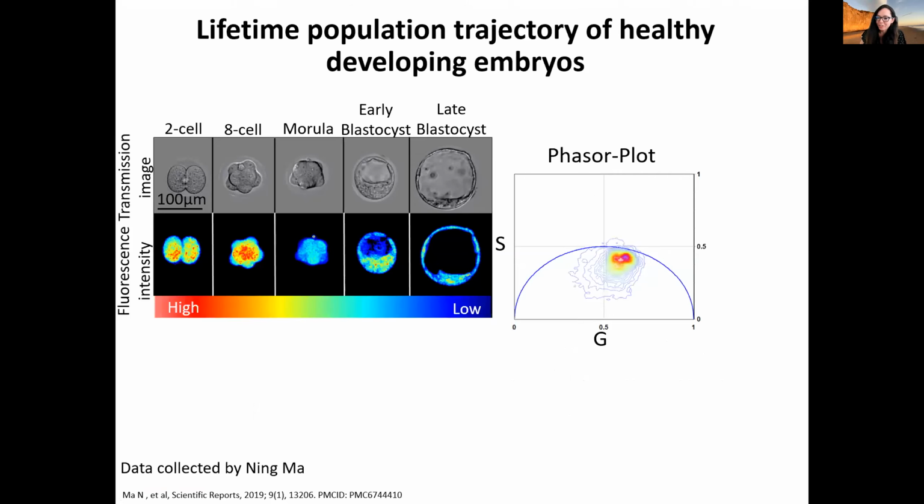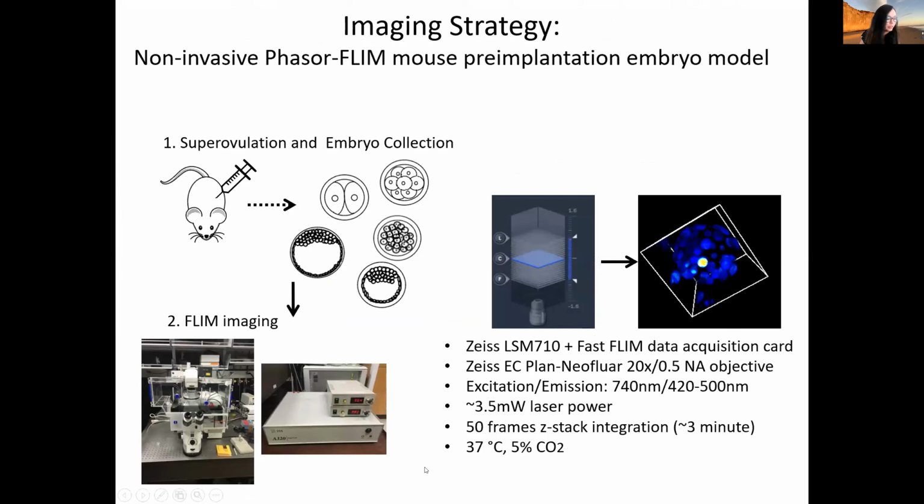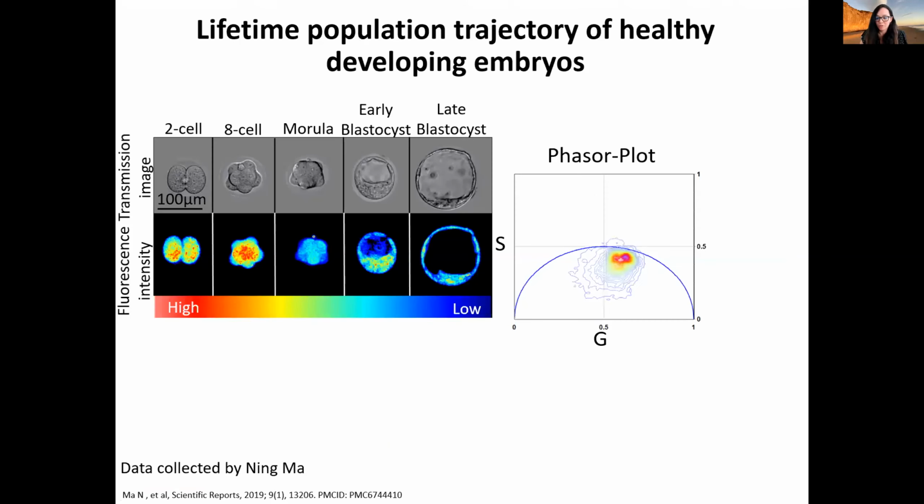So what does the signature of the autofluorescent path look like? And of course, we're only isolating the NADH emission path. As you could see here, we're only selecting the emission at 420 to about 500 nanometers. So this is within the blue emission wavelength of light, and we're not looking at FAD. What is very unique, first of all, about the signature of the NADH in these totipotent stem cells is the fact that the FLIM signature looks completely different than any other cell that we've ever imaged.